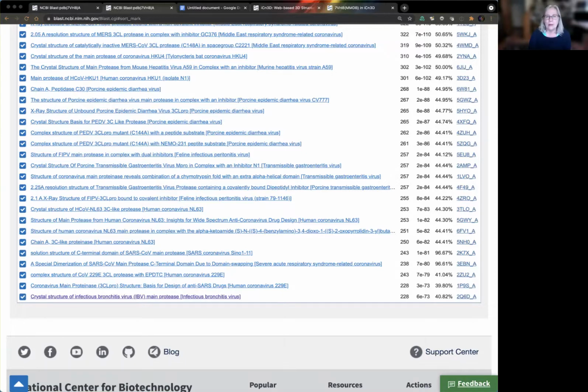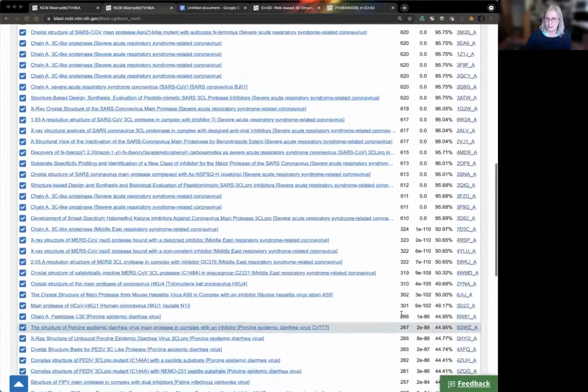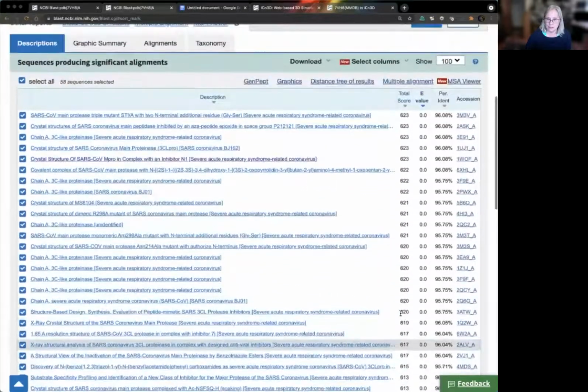So in a way, the e-value corresponds to the probability of finding a match that's random. And if we've got a probability that's 6 times 10 to the negative 73rd, that's pretty low, all right? In other words, those sequences are very likely to have evolved from a common ancestor.